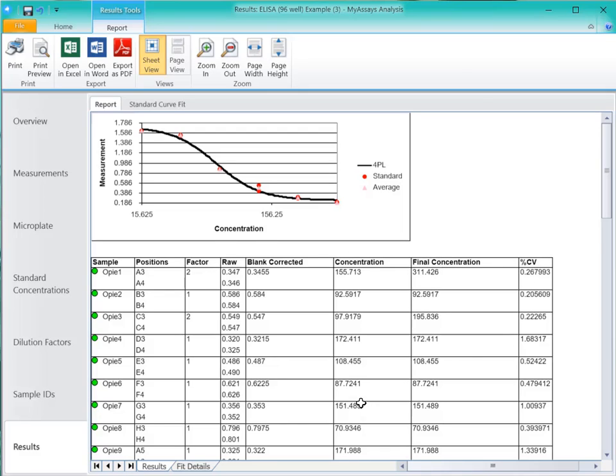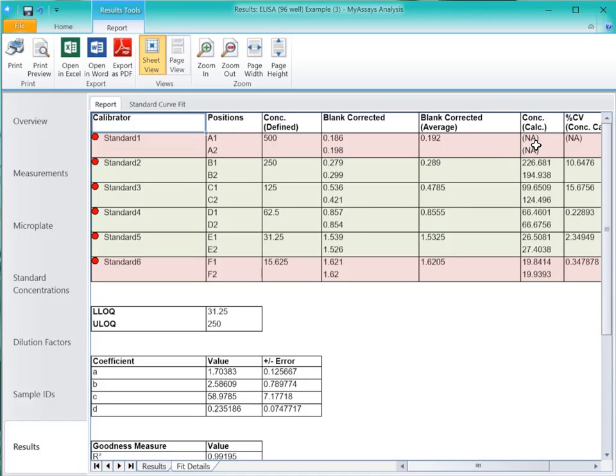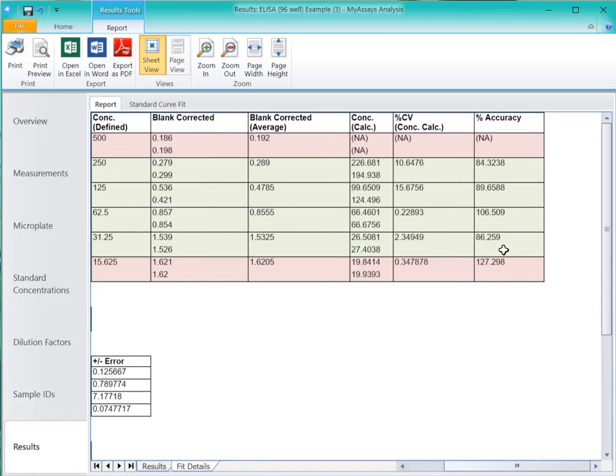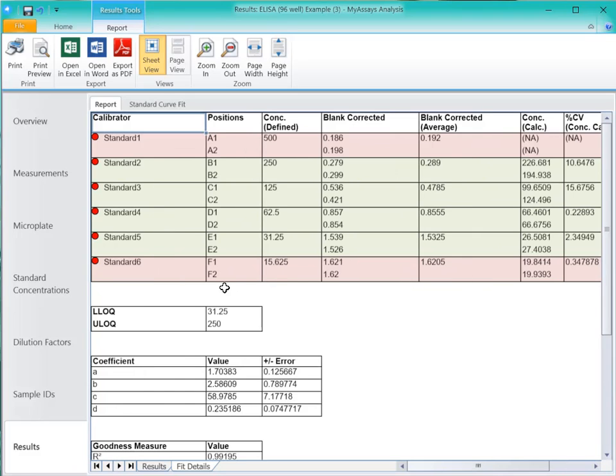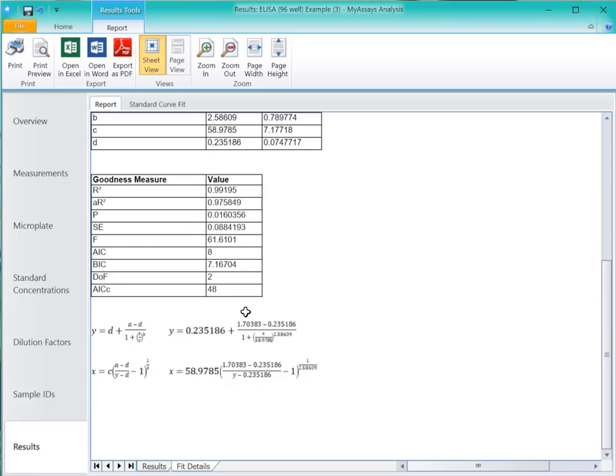On the Fit Details Sheet, we can see the Calibrators chart, with each row highlighted in green if the accuracy and precision thresholds were met, or in light red if they were not.